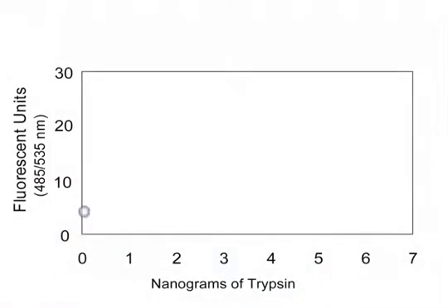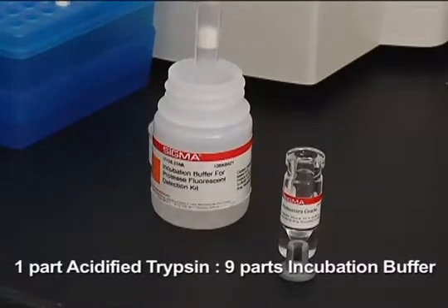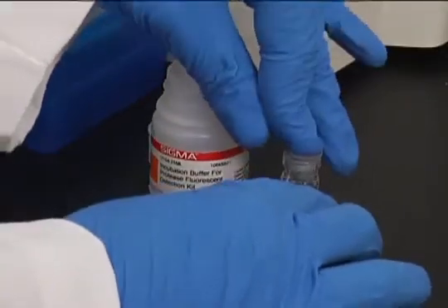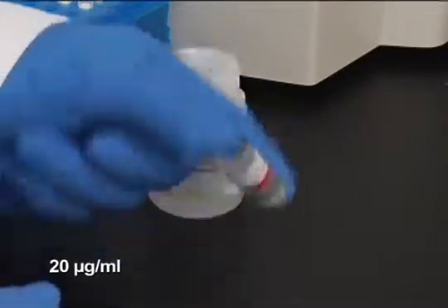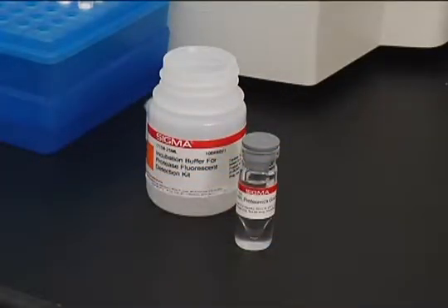The trypsin control sample is used as a positive control that the assay is performing properly, to determine the detection limit, or to create a general standard curve. To prepare the trypsin control, combine 1 part acidified trypsin to 9 parts of incubation buffer, or the buffer used for the test samples, and mix well. The final working concentration of trypsin is 20 micrograms per milliliter. If using a different specific protease, prepare the control solution with that specific protease and an appropriate buffer.